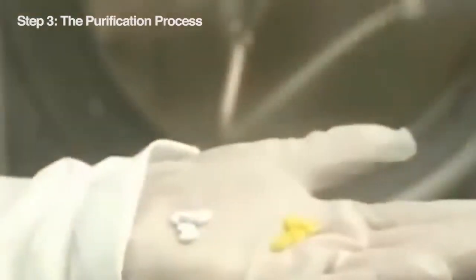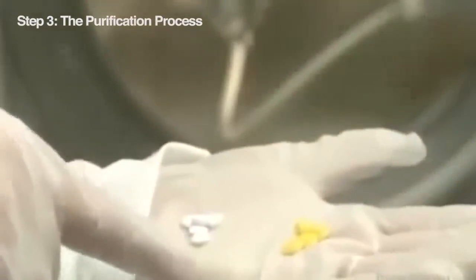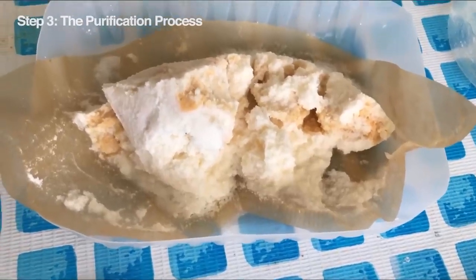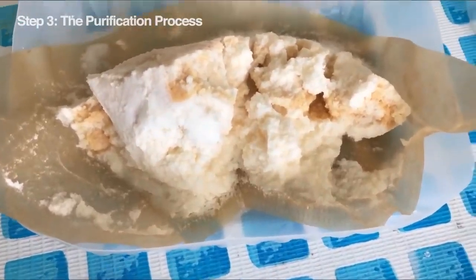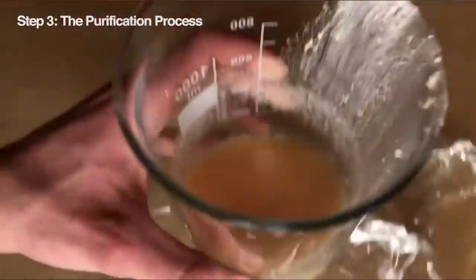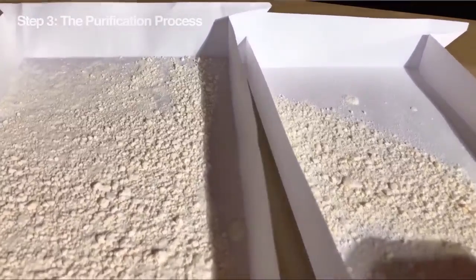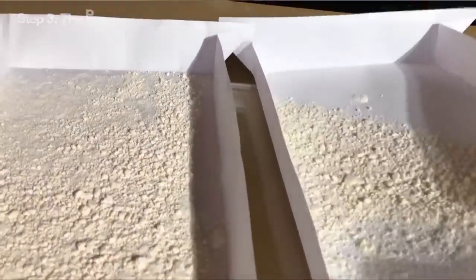As the solution cools down, magic happens. Pure aspirin crystals start to form, leaving the impurities behind in the solution. This purification process is crucial. It ensures that the final aspirin we get is pure, safe, and effective for relieving those aches and pains.